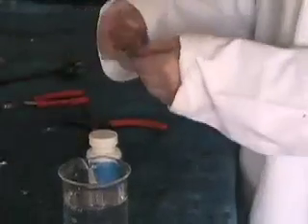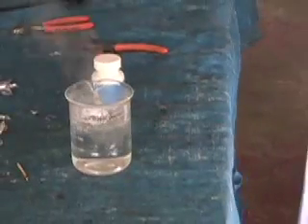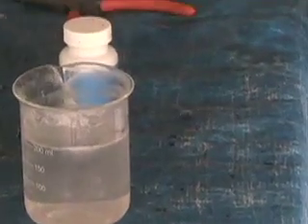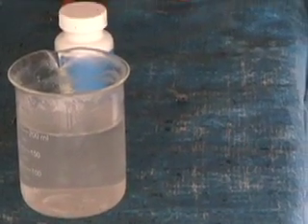Ready, set, go. There we go — lithium in water.